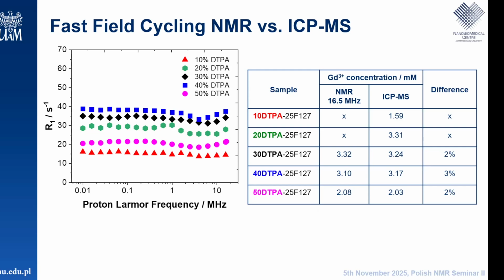So that's good. That means when you don't have ICP-MS in your lab, you can obtain your concentration by using NMR. But what was the most important? Theoretically, when we're increasing the amount of gadolinium in our samples, we can see from the ICP-MS results here that in fact the concentration is decreasing. So this is the opposite. It was not normal and not so obvious for us.